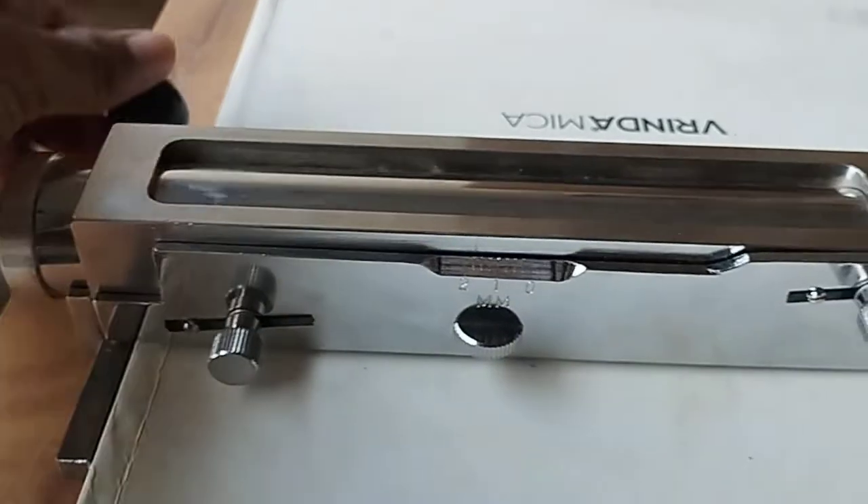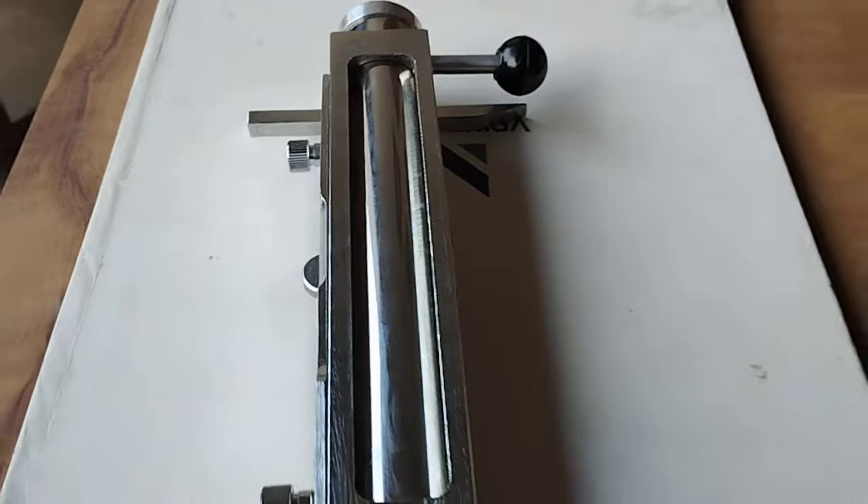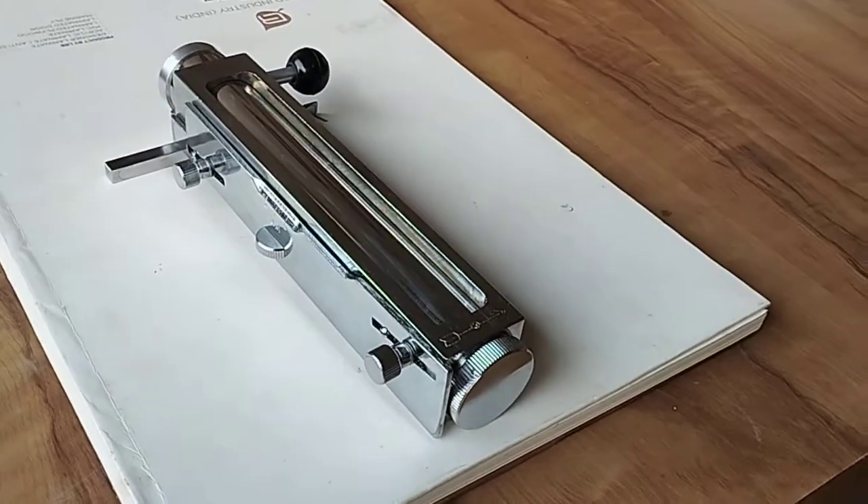As I showed you, this is the open and close mechanism. This is totally made up of brass, best in quality — Harpalinsons thin layer chromatography spreader.